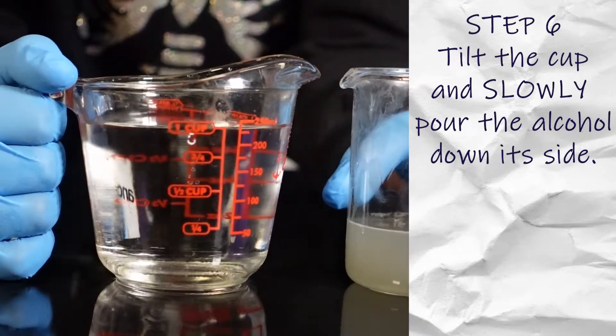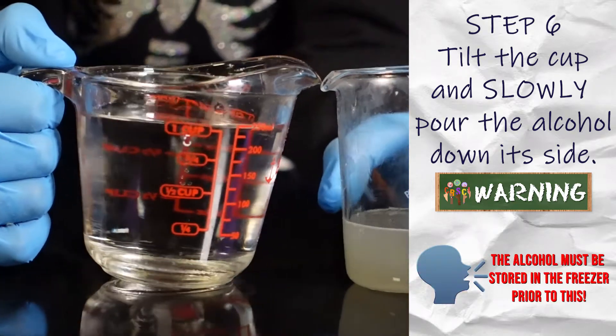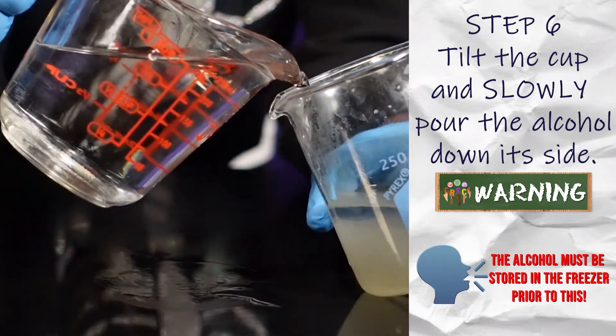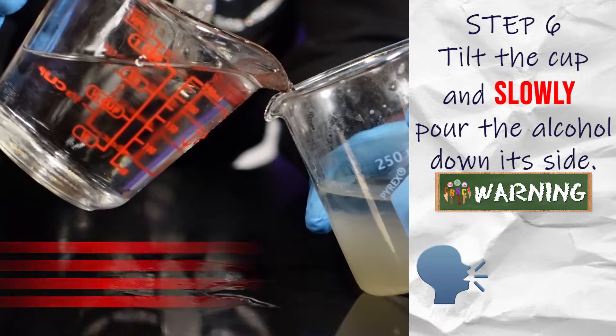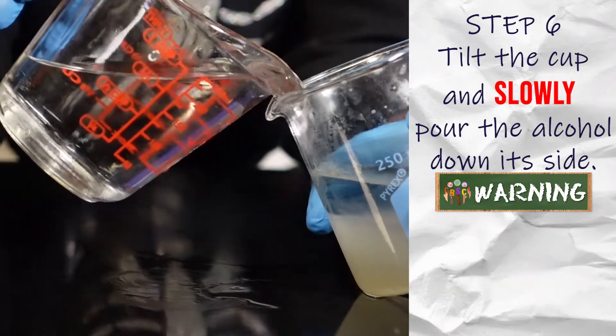The alcohol creates a layer that our DNA won't dissolve in, so that way we can pull it up and see it. He is tilting the beaker where the DNA is already in and pouring the alcohol in.